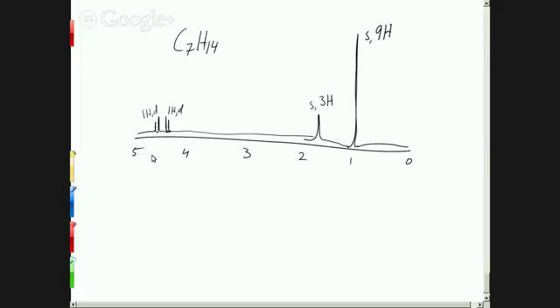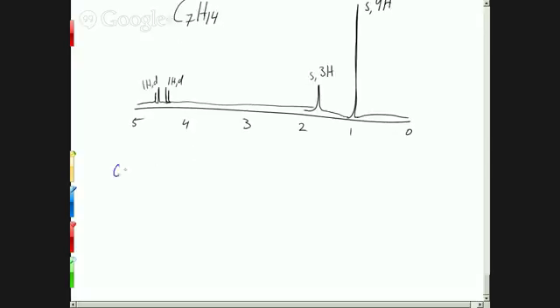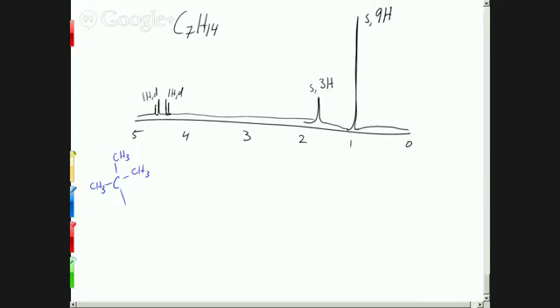So let's say that's possibly one of our pieces in this molecule, one of our pieces that we're going to be able to put together. That's going to look like this. And then that's going to be our connection point where we can connect to something else. So that might be this. Notice I'm using words like might because there's guessing involved here. You have to guess what these things might be, try to put them together, and then go back and see if they fit the spectrum. If they do, you're right. If they don't, then you got to go back and question your previous assumptions.